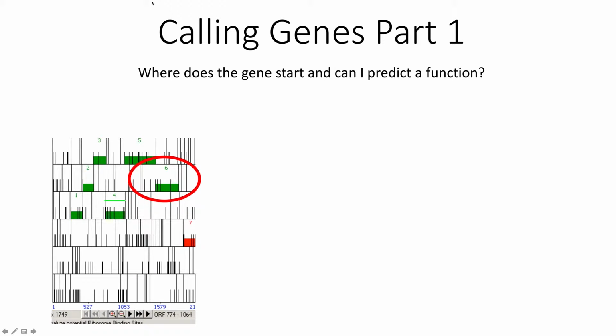In this video, we're going to talk about how to call genes. In part one, we will talk about what the rules for calling genes are. And in part two, I will demonstrate how to collect data for calling a gene, how to analyze that data, and how to record your analysis in your notebook, but also in DNA Master's Notes section. So what do I mean by calling a gene?